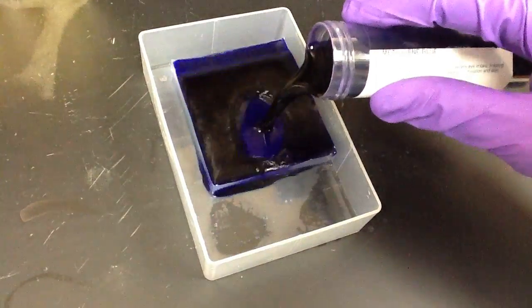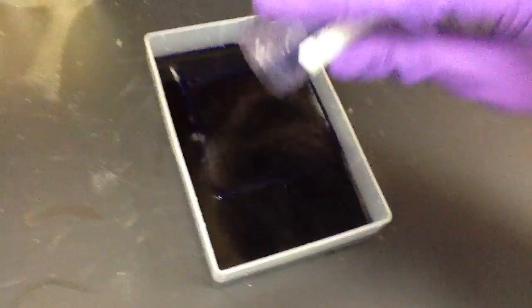We start by placing our gel into a container and pouring the dye on it. We let it incubate with the dye for one minute before pouring the dye back into its container.